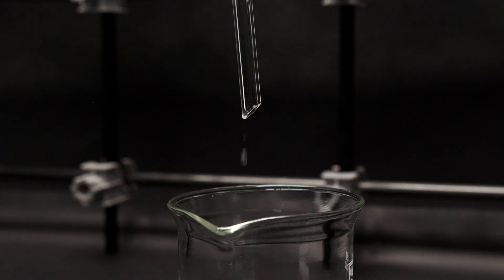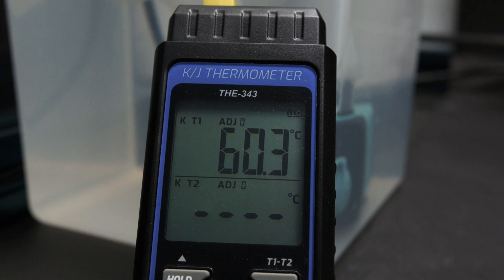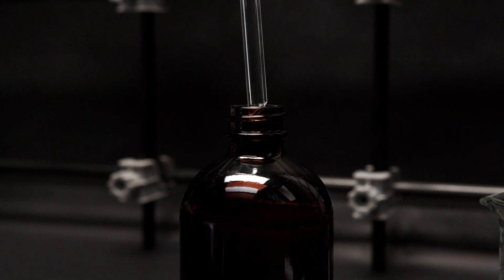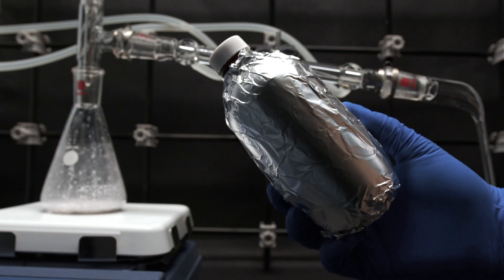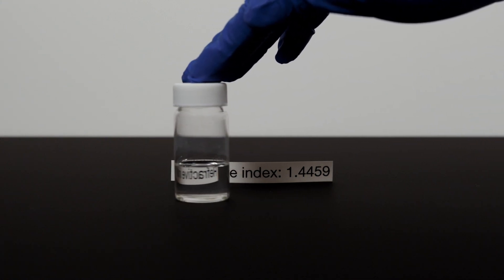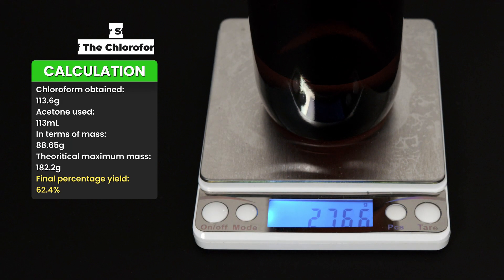The first fraction of distillate is usually cloudy and will be discarded. Distillate collected at 60 to 62°C should be our desired product, chloroform. Switch the collection flask to an amber bottle or foil-wrapped bottle to collect the product — this is necessary as UV light will promote the decomposition of chloroform. You can see that the refractive index of chloroform is higher when compared to most liquids.